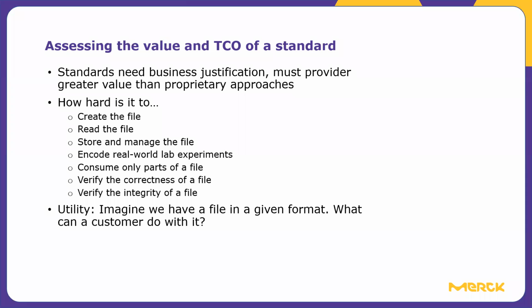We can look at how hard it is to create such a standardized file, or how hard it is to read the information that is inside it, or how to store and manage that file. Can we encode real-world lab experiments in it, the types of experiments that we are doing? How hard is it to consume only parts of a file, or to verify the correctness of a file, or to even verify the integrity of a file?